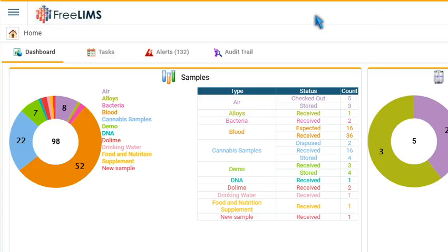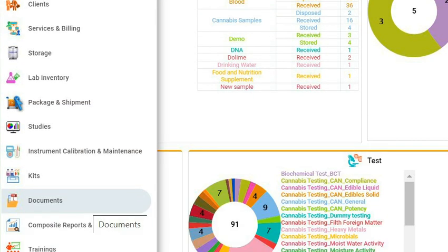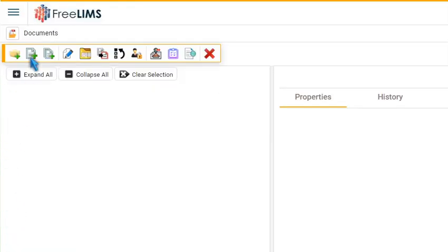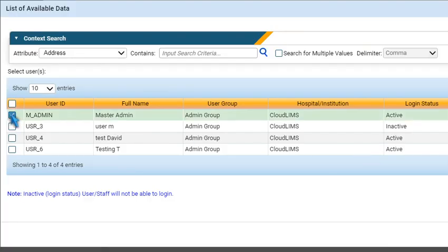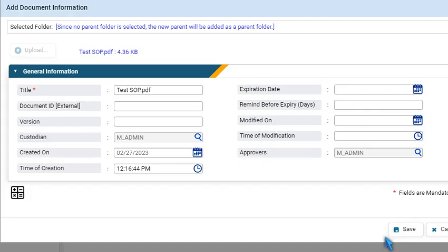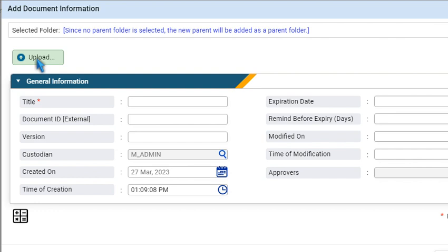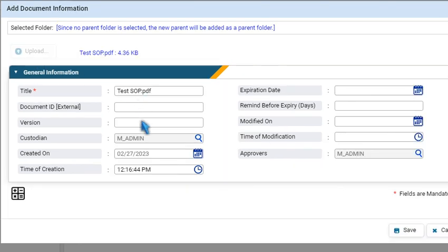As a first step, navigate to the Documents module and click the Add Document icon. Select one or more approvers of the document, specify necessary document information, and then press Save to add the document.